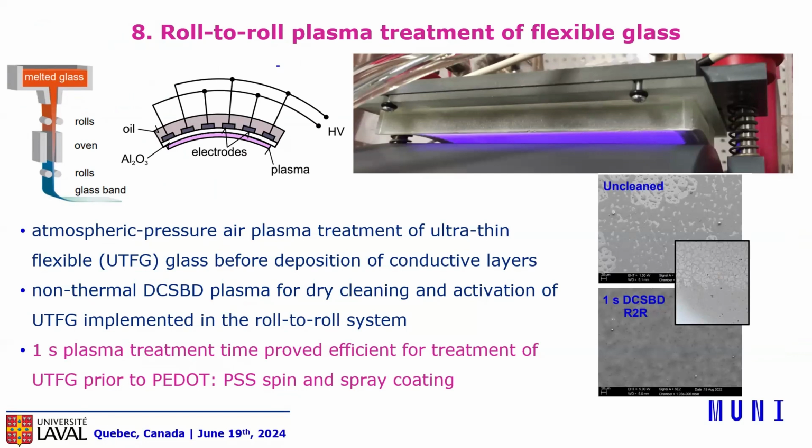Normally in laboratory scale, we place the samples on this roller. There is a defined speed, yeah? And we know that in the direction of rotation of this roller, we have active plasma of 8 centimeters. So we can calculate very simply the speed of the roller, which corresponds to seconds of treatment. So you place your sample somewhere here, away from the plasma. In fact, during the treatment, it comes nearer. Your roller is moving with a defined speed, and this speed corresponds to the surface treatment. So we are able to adjust the speed of the roller.